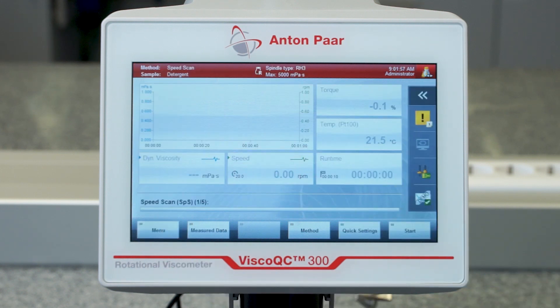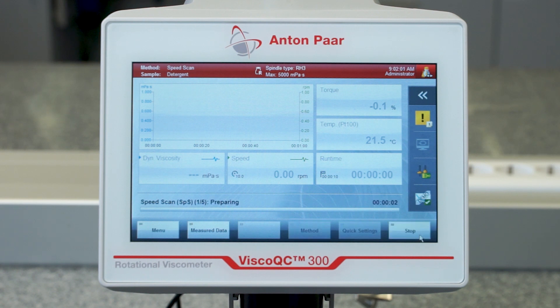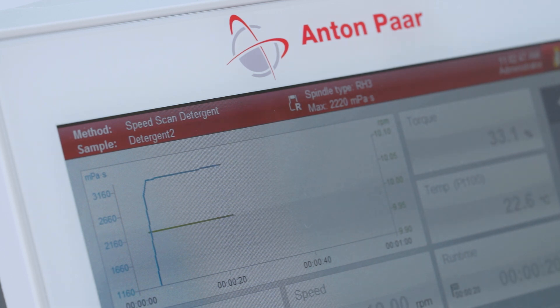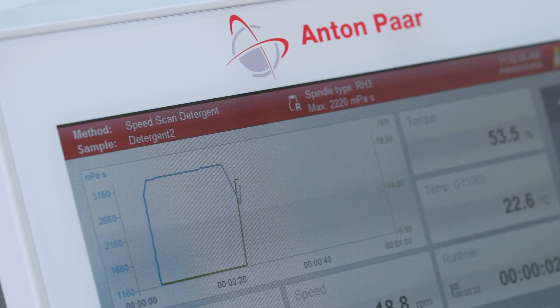Restart your measurement. With v-curve you can now not only follow live measurement data but also program steps, determine the static yield point with vein spindles, and use mathematical models for analysis.